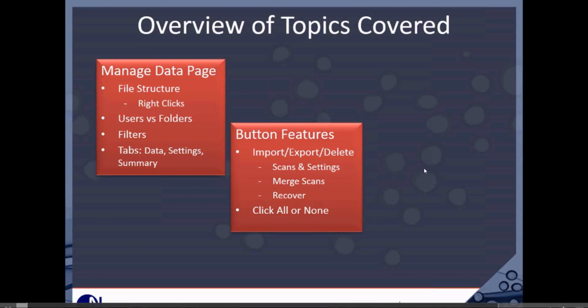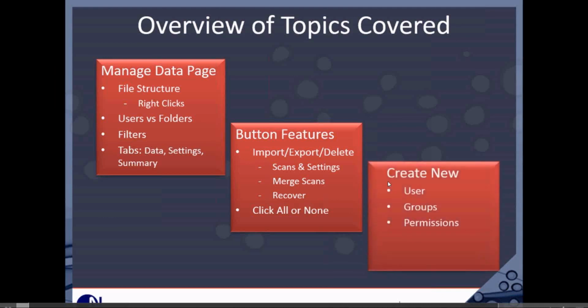And then in the last part of it, I want to show you guys how you can actually create new users for the system. So if you have new lab people coming into your lab, or you have new lab groups, then you can actually create new users.